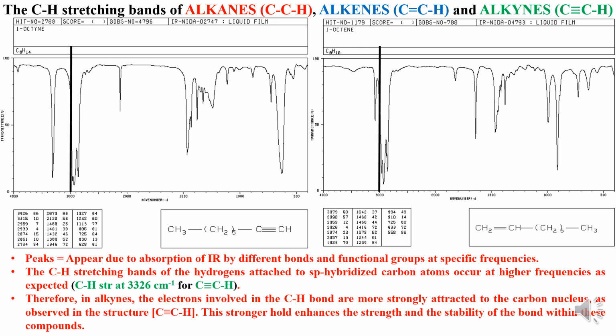That is why it is always better to draw a reference line at 3000 centimeter inverse. You can say it is a kind of differentiating line.